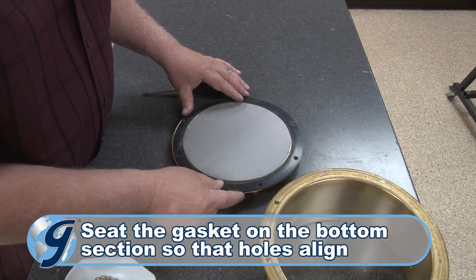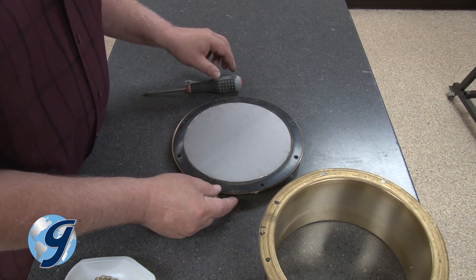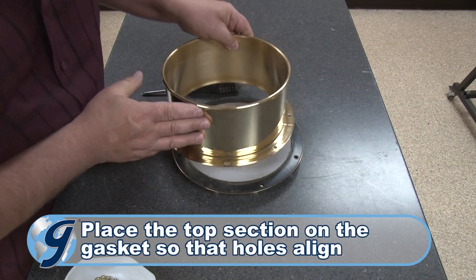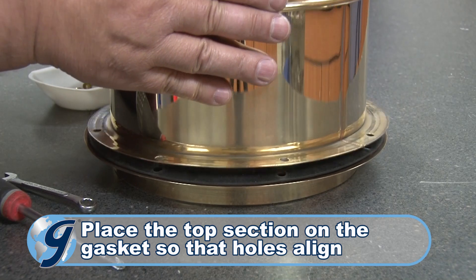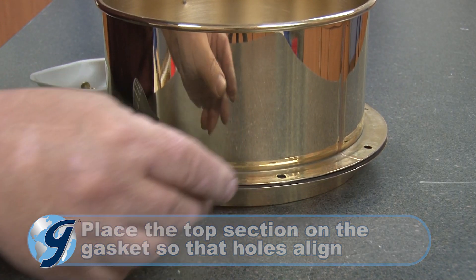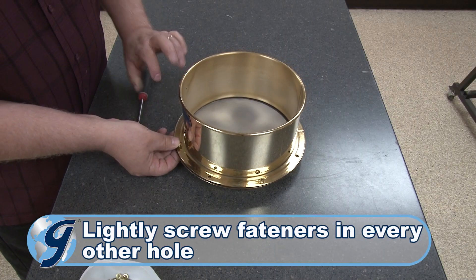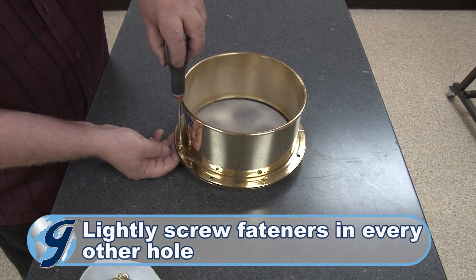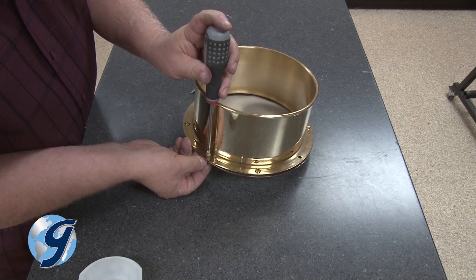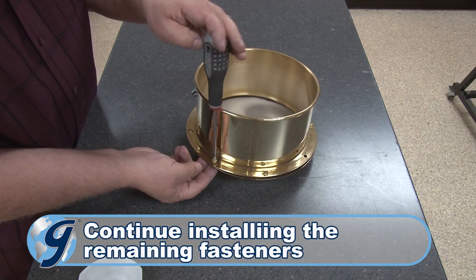Next, seat the new gasket on the bottom section so that the gasket holes align with the holes of the bottom section. Now place the top section onto the sieve so that fasteners can go through the holes of the top section, the gasket, and the bottom section. Place a fastener in every other hole and hand tighten with the nut — do not fully tighten the fasteners until later. Then finish installing all the remaining fasteners.